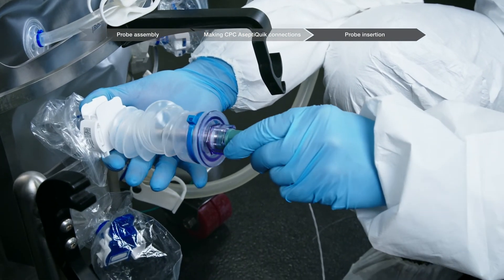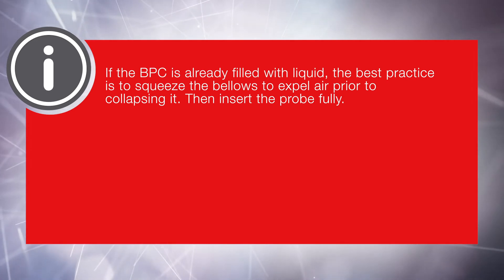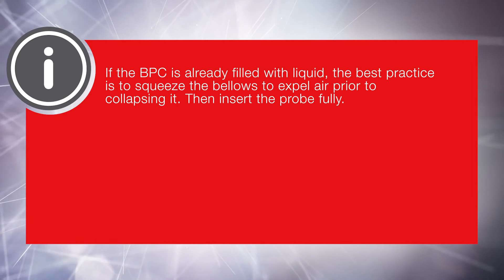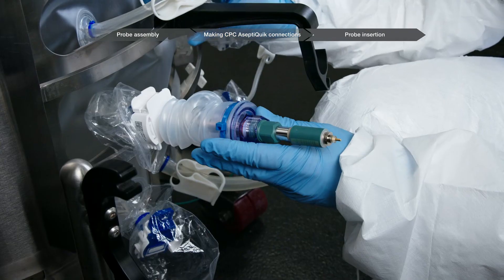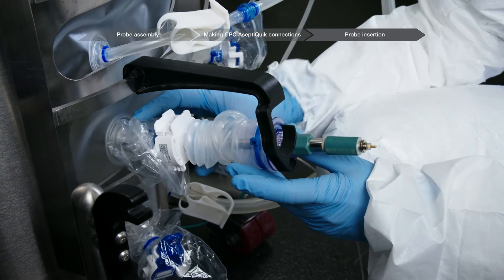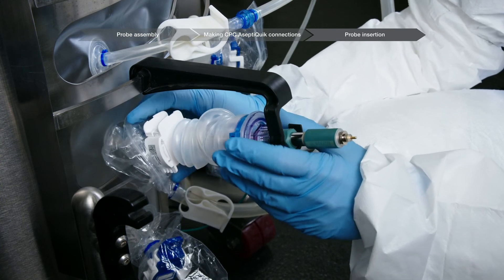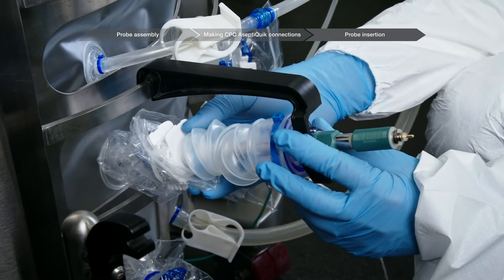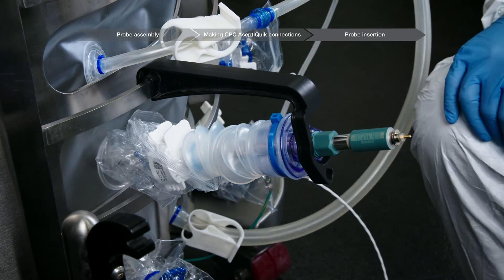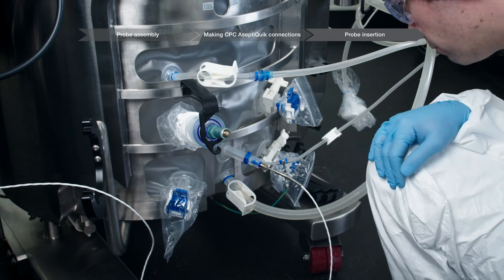Insert the probe by collapsing the bellows. If the BPC is already filled with liquid, the best practice is to squeeze the bellows to expel air prior to collapsing it, then insert the probe fully. Position the plastic probe clip in the desired horizontal location. For plastic probe clips, lift the probe and set it into the bellows hook before releasing the probe assembly. Release the probe assembly and verify that the probe remains at the proper insertion depth and angle when the bellows expands to rest freely in the probe clip.